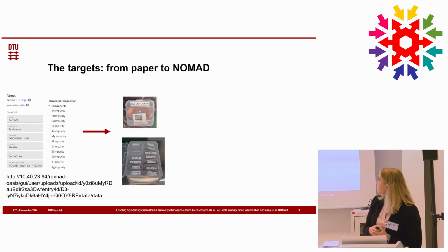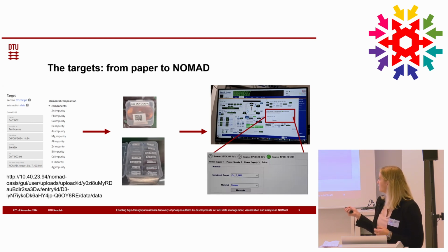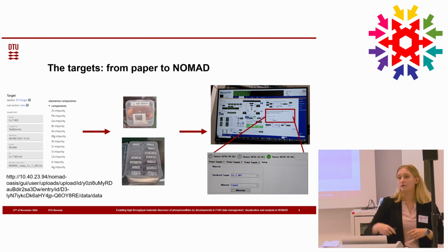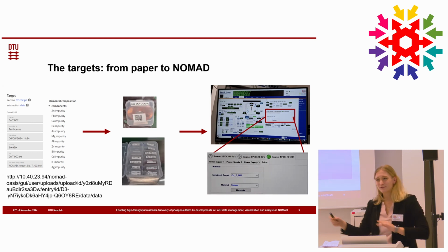The next step that I do is I go to our tool, and I actually introduce this target to our tool. So right here, our deposition tool, which target is used. So that later on, when we use the log file, that I will also show you in a few minutes, we can directly automatically connect this target. So I don't have to take care of that anymore. It just knows.